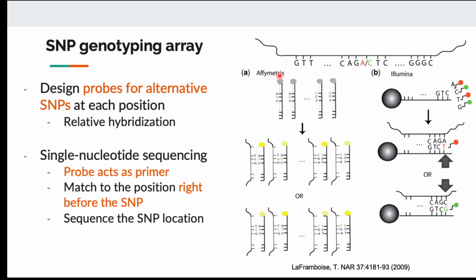So you can also imagine this like in the Illumina or 454 sequencing platform, where you have different locations on the flow cell, different locations on the machine that sequence different DNA. But when we do next generation sequencing within the machine, right, we have no idea which region of the genome is being sequenced at each location on the flow cell, because it's all random.